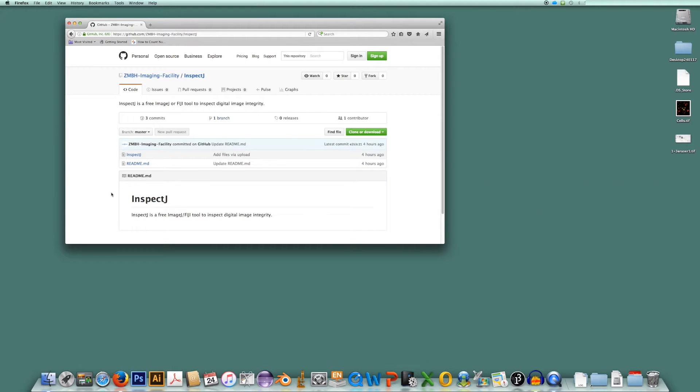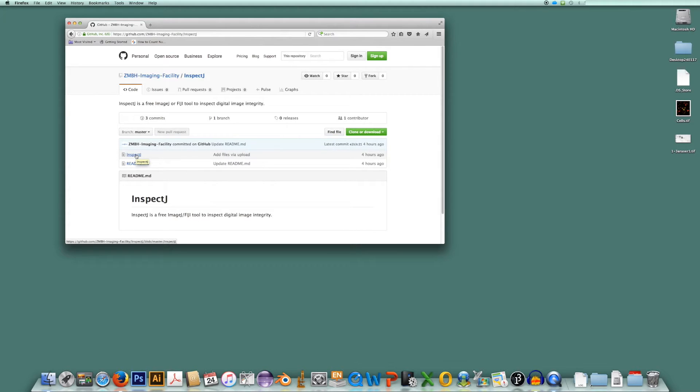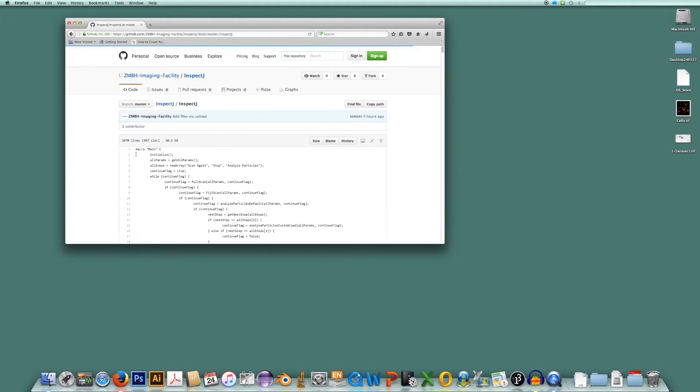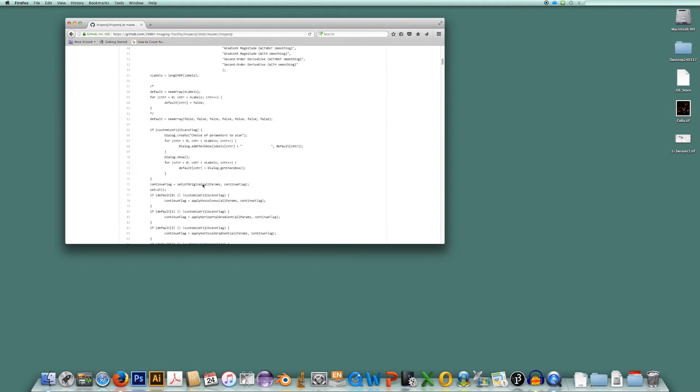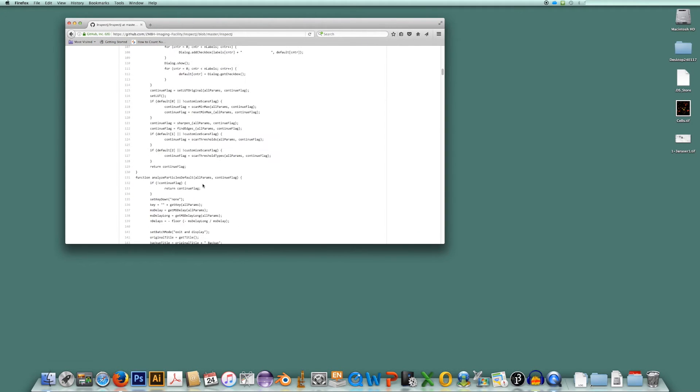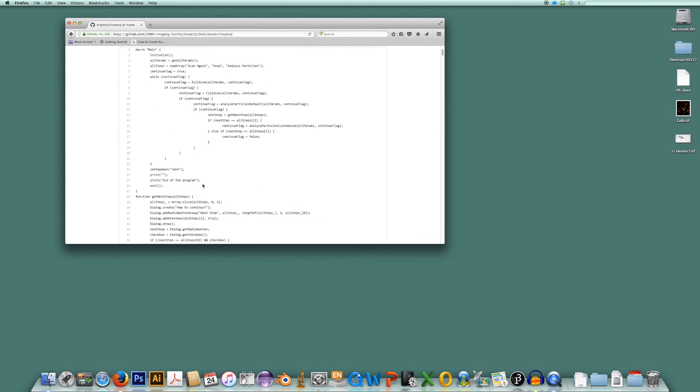And here it is. Here you can see the InSpecJ software. If you want to have a look at it, just click on it. And here is the software code for InSpecJ.